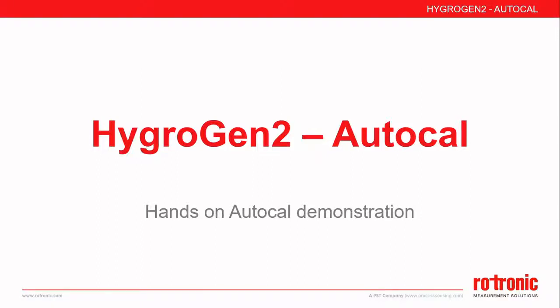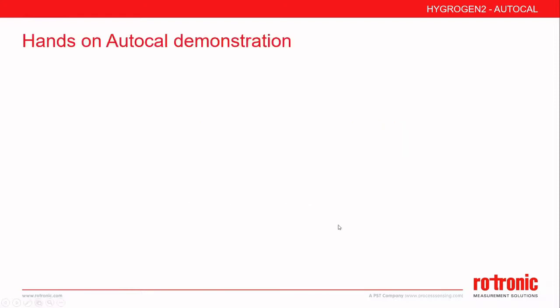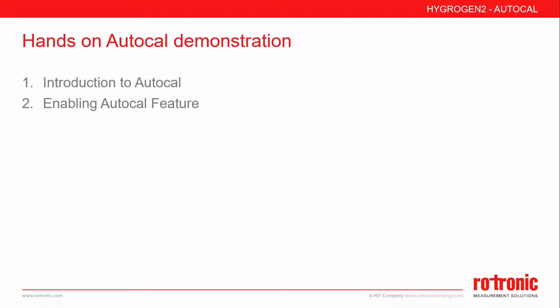Welcome to this HYGROGEN2 AutoCal hands-on demonstration video. In the following slides, we will take a brief look at some of the AutoCal functions and features and provide some best practice guidance. We will introduce AutoCal and its basic functions. We will demonstrate how to enable AutoCal on your Hygrogen. We will go through the basic AutoCal setup.